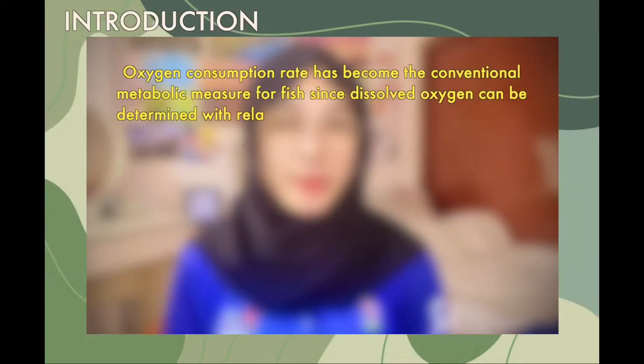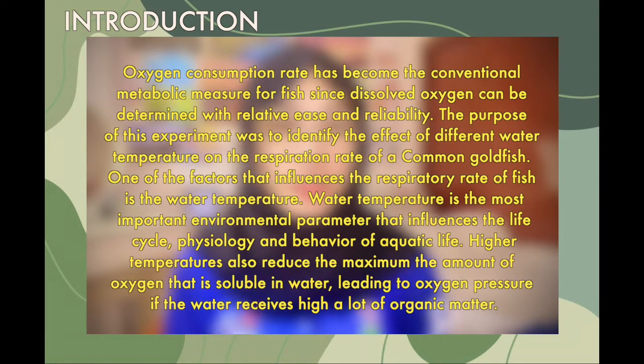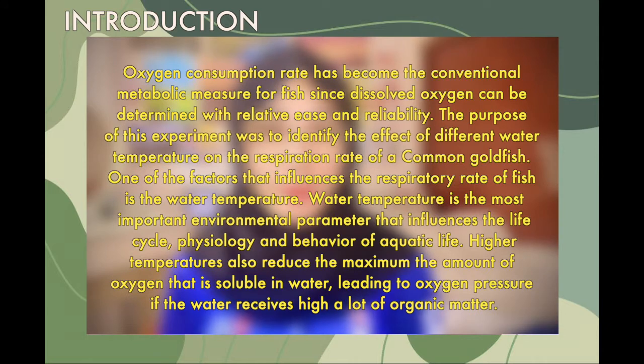Oxygen consumption rate has become the conventional metabolic measure for fish since dissolved oxygen can be determined with relative ease and reliability. The purpose of this experiment was to identify the effect of different water temperatures on the respiration rate of a goldfish. One of the factors that influences the respiratory rate of a fish is the water temperature.